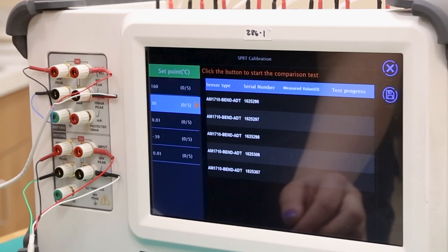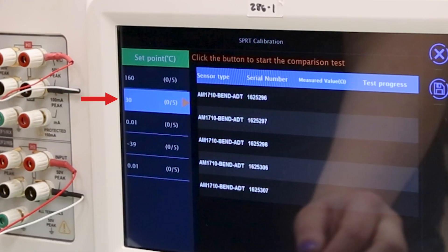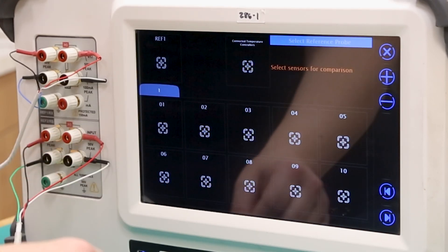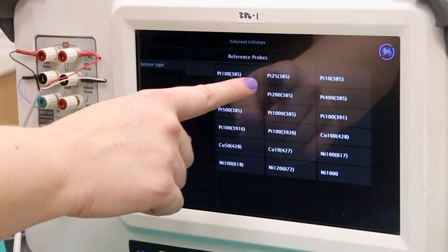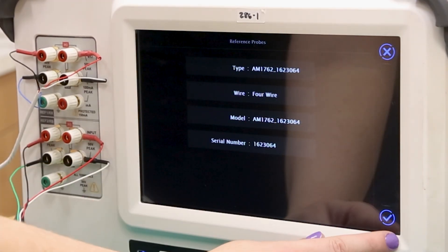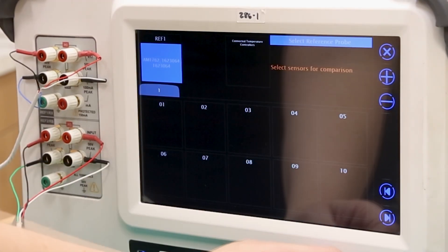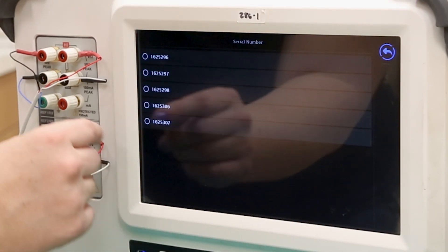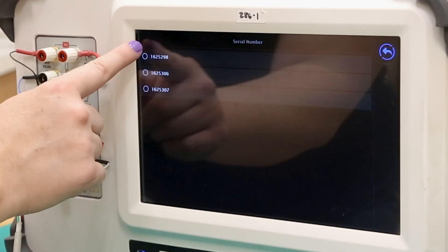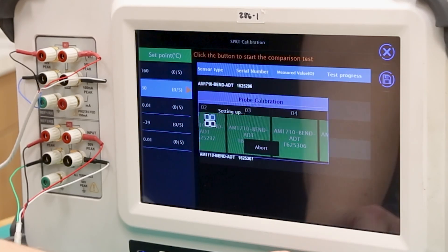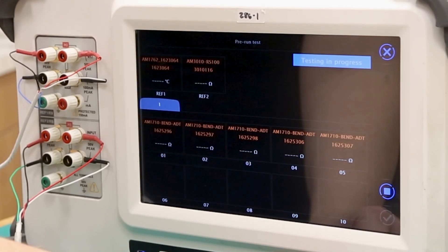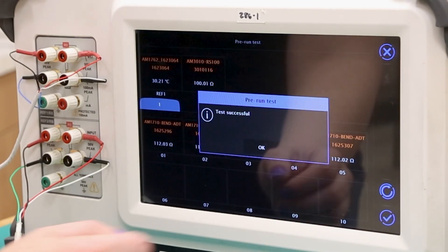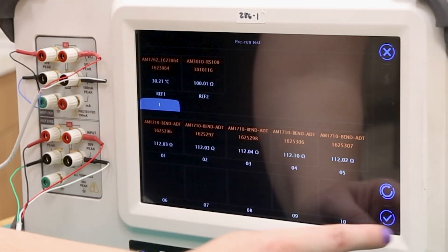Return to the 286 screen and select the 30 degree setpoint on the left hand side. Select the first probe to enter the calibration screen, where we will add each of the probes for the automated measurement. First, add the reference SPRT from the list of preset probes and press the check mark to move on. Then press the next button and add each probe to be measured to the corresponding channels that they're connected to. Press the next button again once finished. The 286 will now test each probe signal to ensure that they are reading correctly. After that, press OK and the check mark in the bottom right corner to move to the next section.